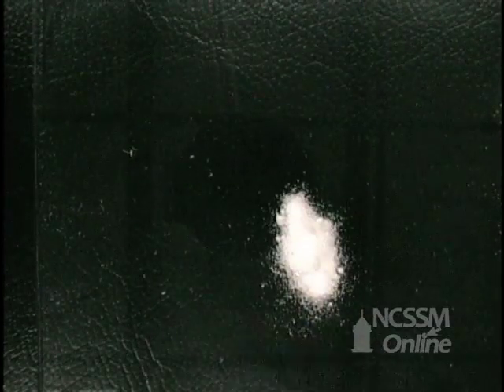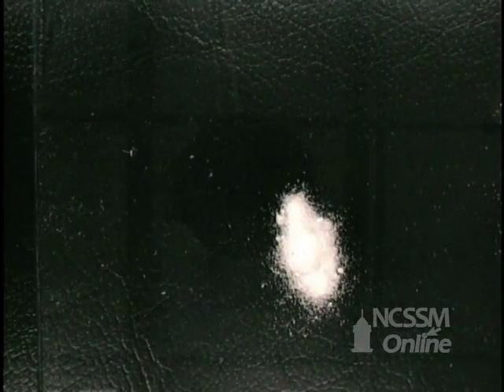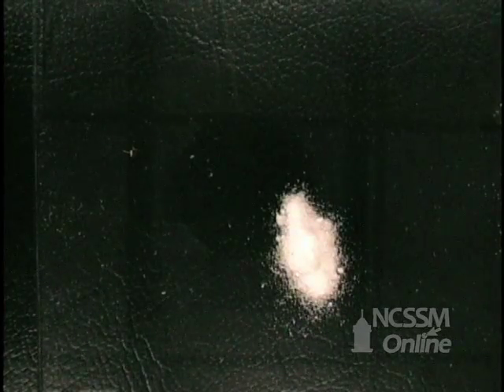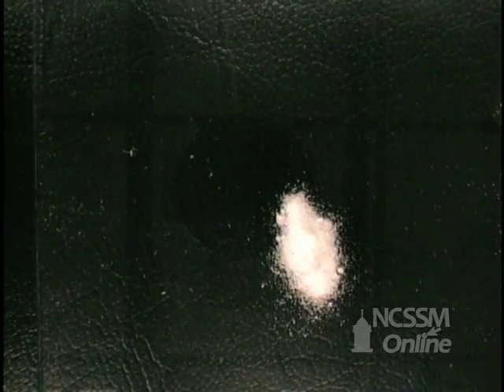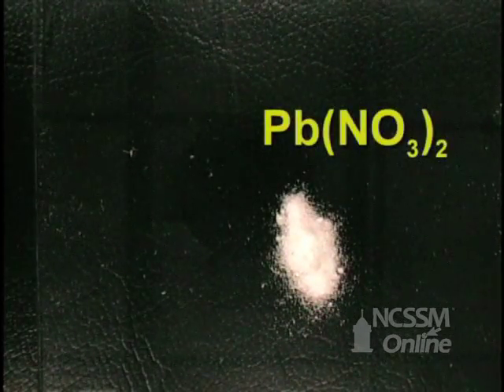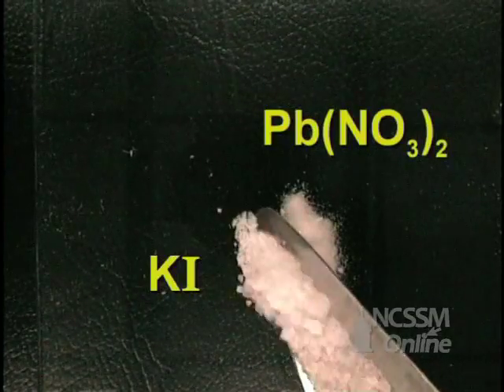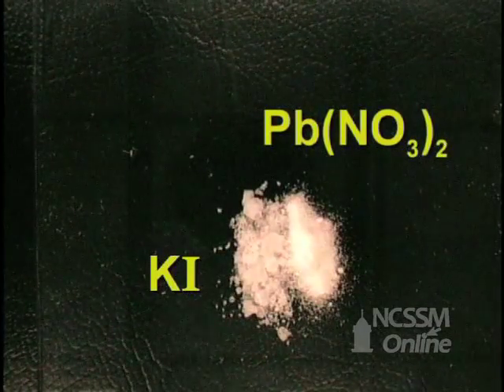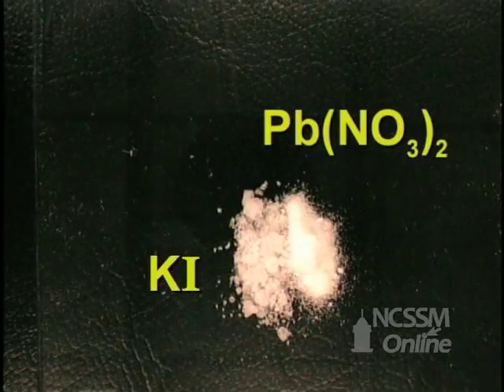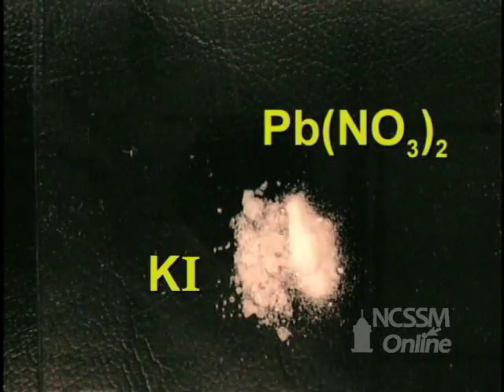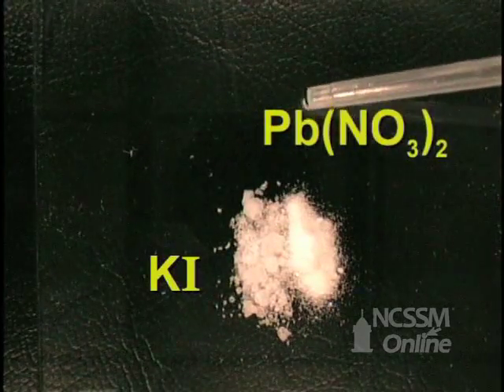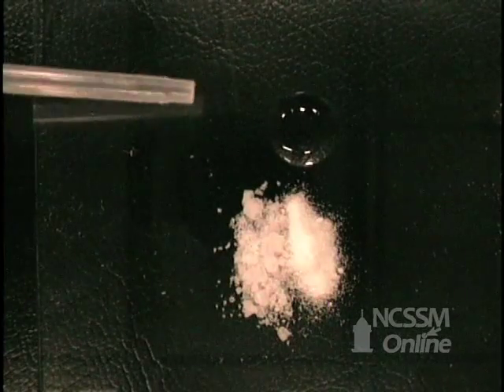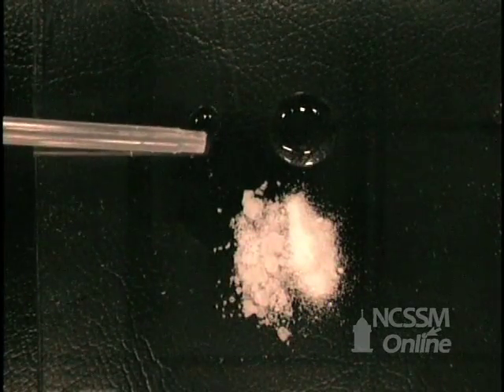Let's look at the effect of the state that a substance is in and the rate of the reaction. Here we're going to add some lead nitrate and some potassium iodide. Both are solids at room temperature. If we put them next to each other, nothing happens.